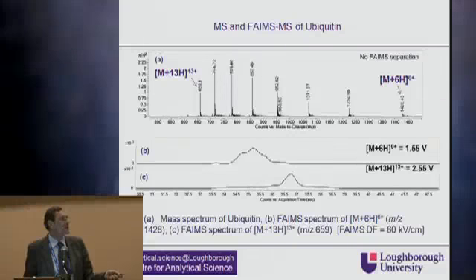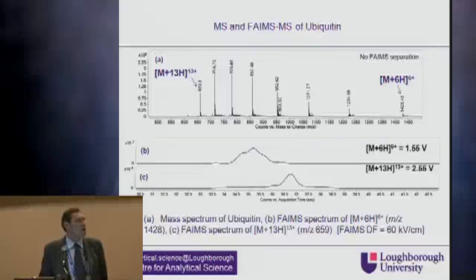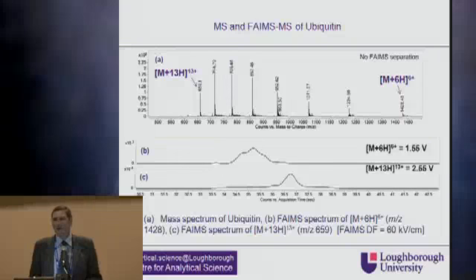This just quickly shows ubiquitin, and for the 6th charged ion of ubiquitin, you can see that there's clearly a complex composite peak here, which is associated with different conformers. Now, Alex's presentation in a little while is going to talk a lot more about high-resolution separations of conformers in these systems, so I'm going to say no more about it now. You'll learn more from the master in a little while.